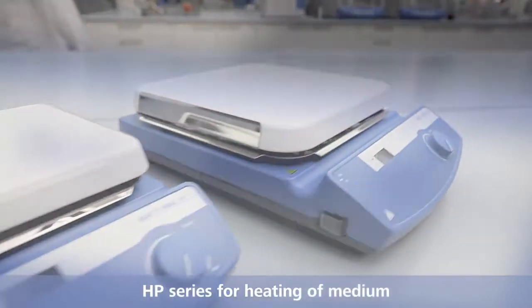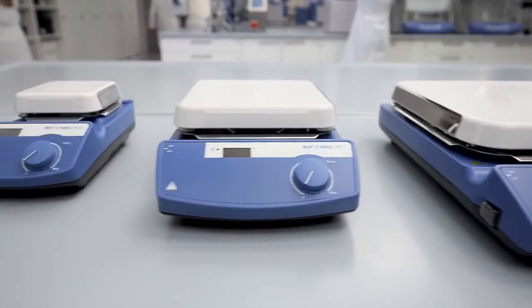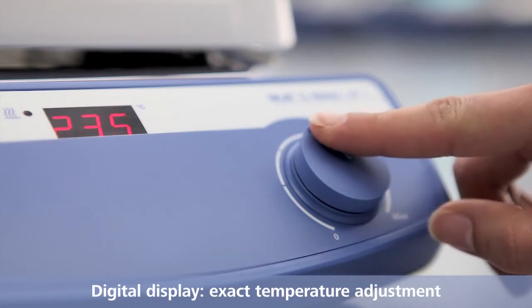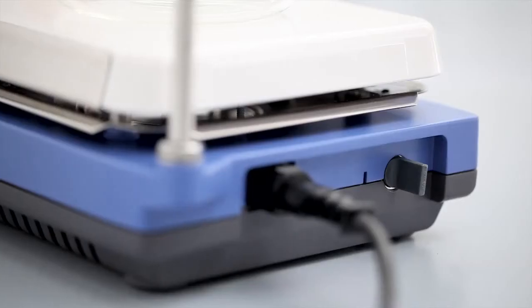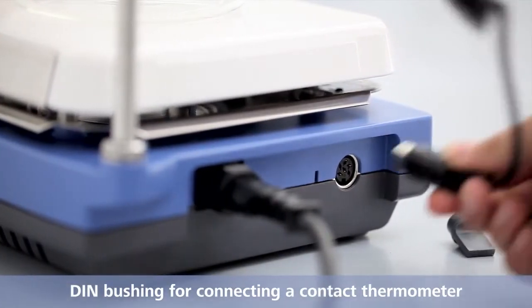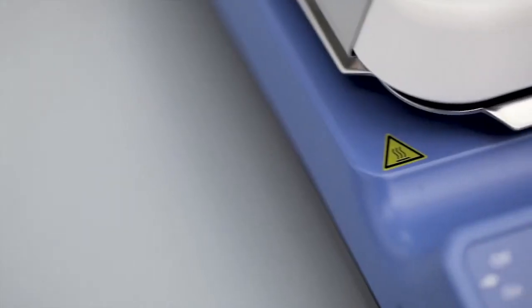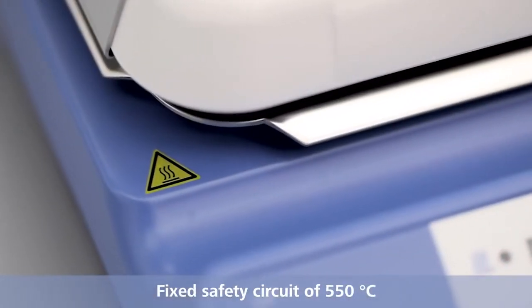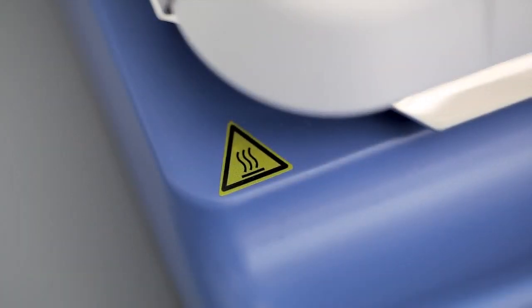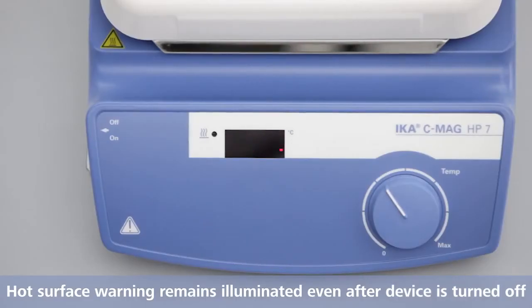HP series for heating of medium. Digital display for exact temperature adjustment. DIN bushing for connecting an electronic contact thermometer. Fixed safety circuit of 550 degrees Celsius.